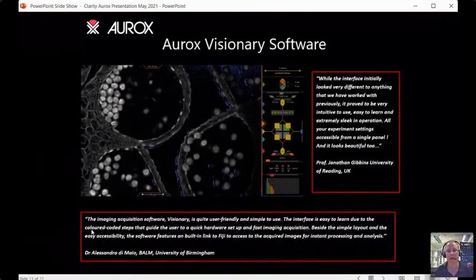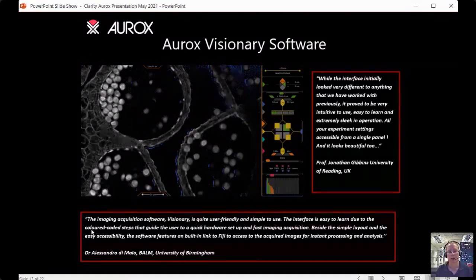I mentioned ease of use. Most of the ease of use comes from the system being small and laser-free — no extra training needed. We developed the Aurox Visionary software to be very simple so anyone can use it, whether a student or a biologist. You don't need advanced knowledge of confocal microscopy. Most people are surprised at how different it looks compared to traditional confocal software, but within five minutes they're using it unaided.